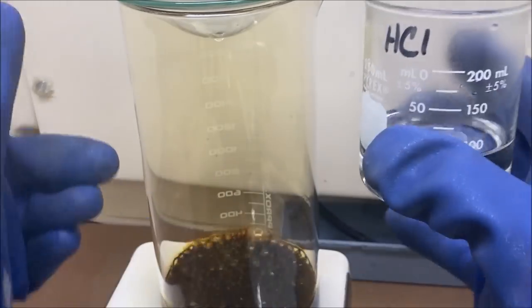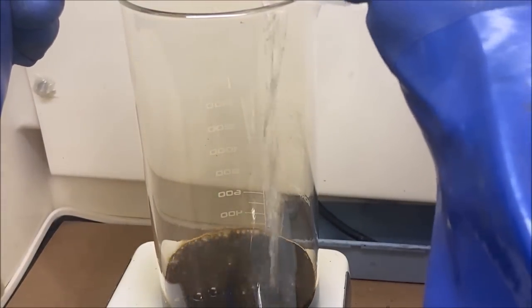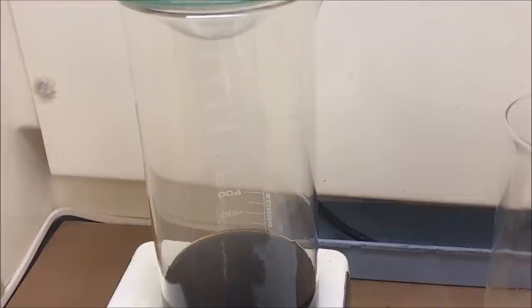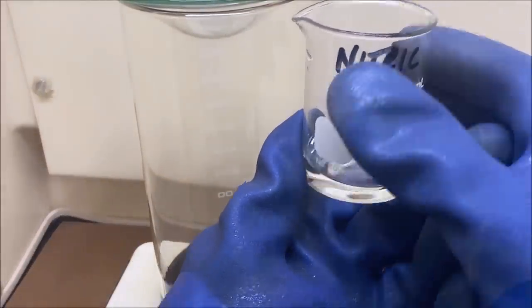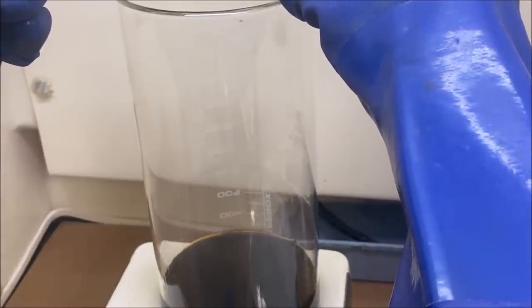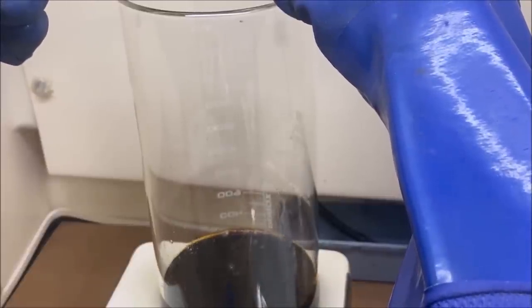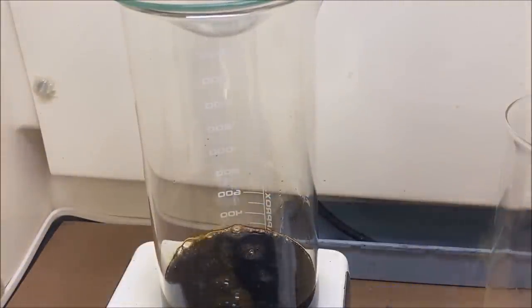Just going to put the hydrochloric acid right on in there. And then we're going to follow that up with the nitric acid. It's about 15 milliliters. Add that slow because this is hot. See if we can get the rest of that metal to go into solution.